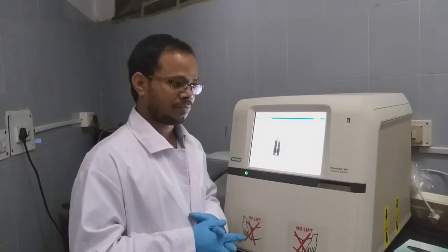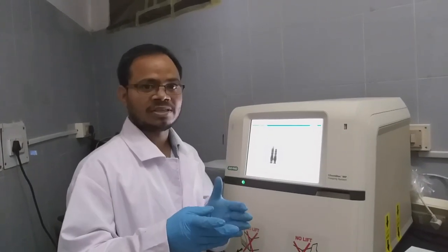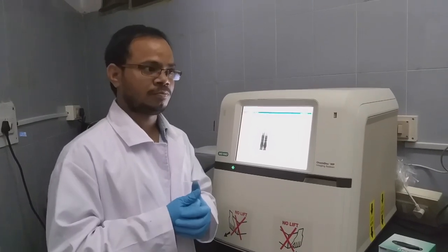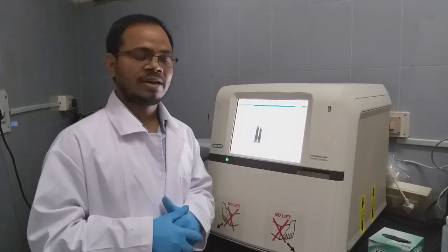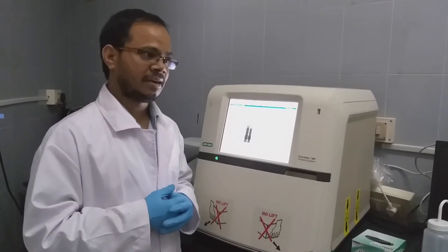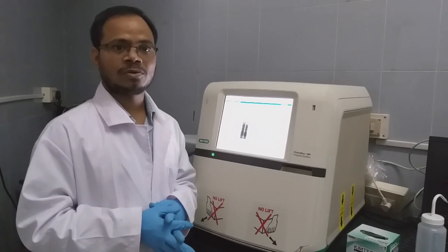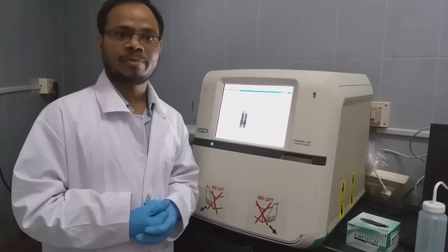Contaminants sometimes may come because of two, three or four histidines in a folded state, which give the possibility to bind to the nickel NTA column. Also, vigorous washing should be done. If you don't wash properly with a high amount of imidazole, that will give you this kind of non-specific binding.